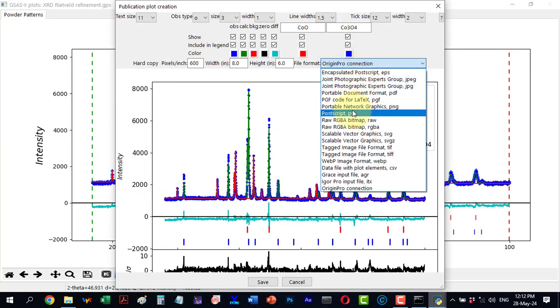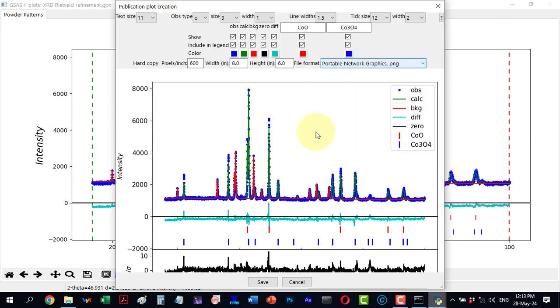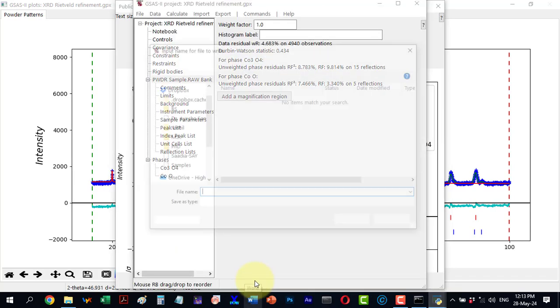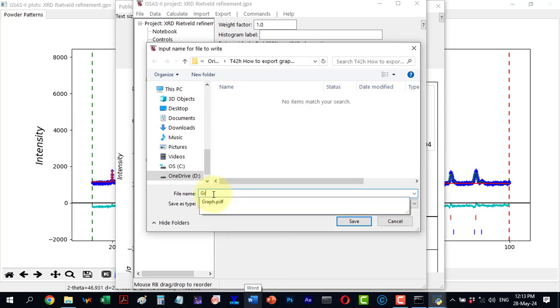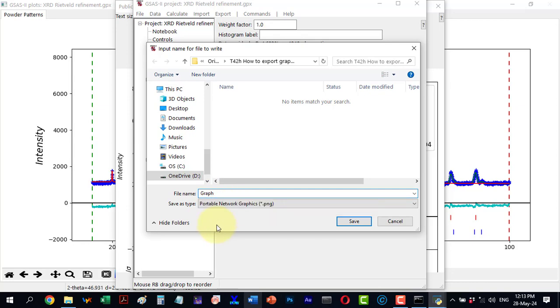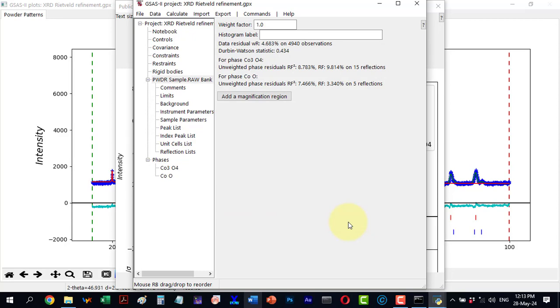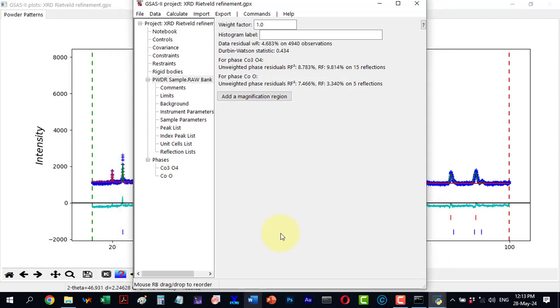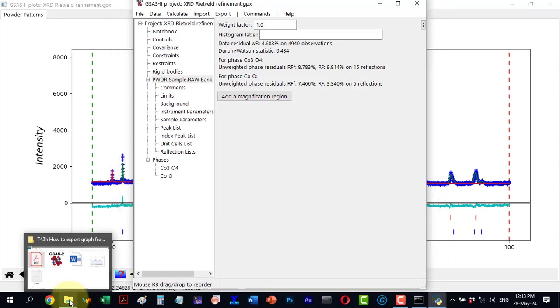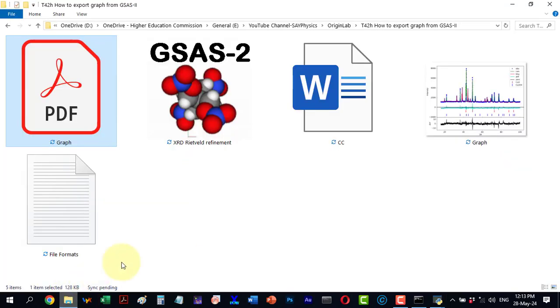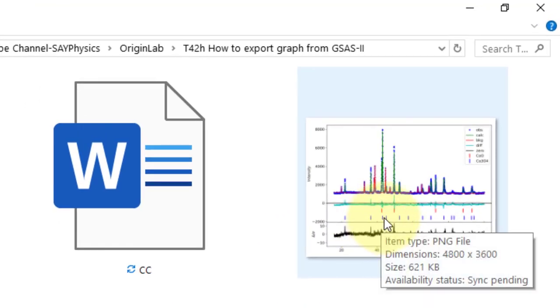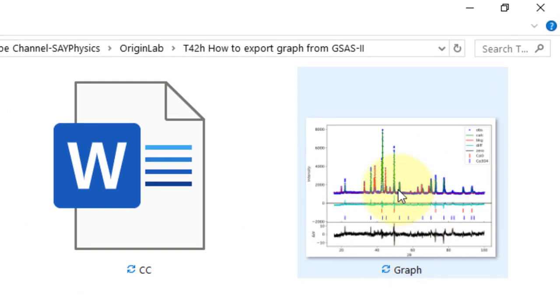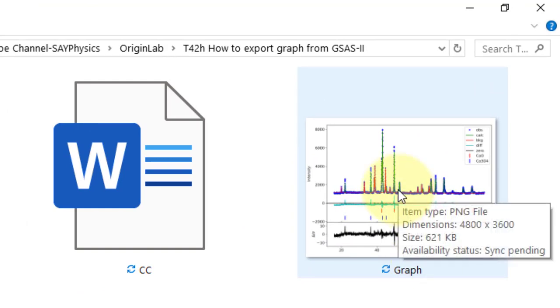Let's select the PNG format and save the graph. I will give it a name and save it. The PNG format is lossless. The file is now ready.